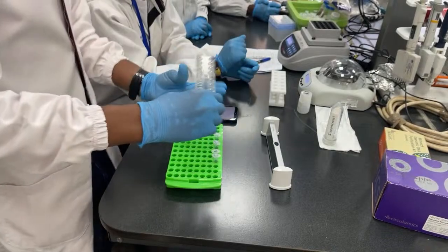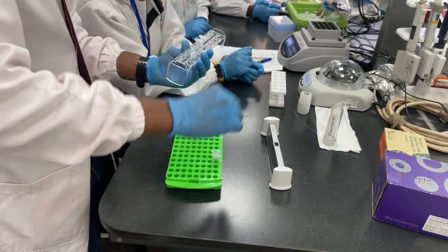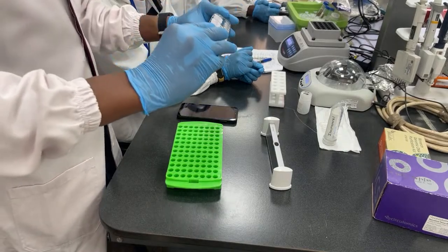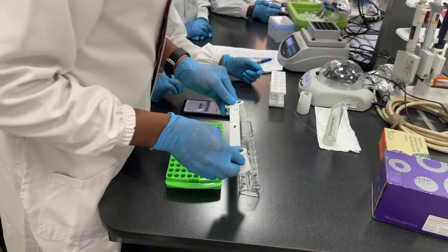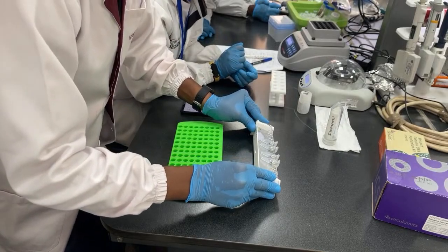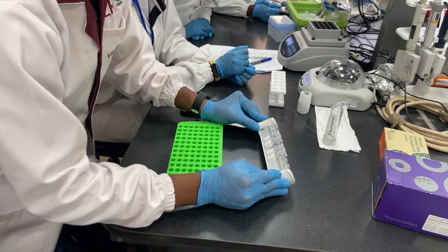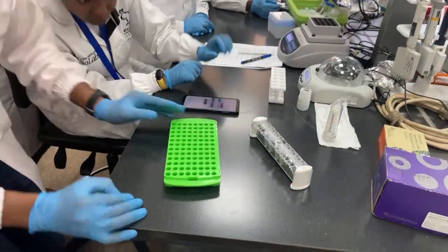So you see, we do this. Load this here. Tilt this upside down. You should have balanced it. The next step is to put this while it is upside down. You see? This way we want them, right up there.